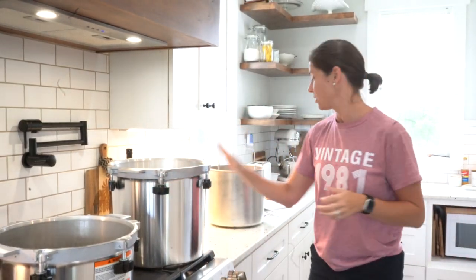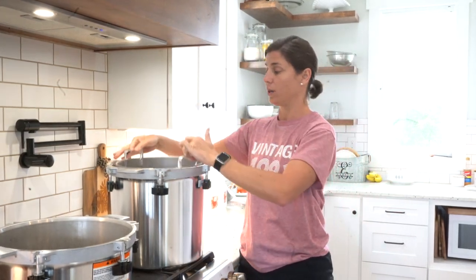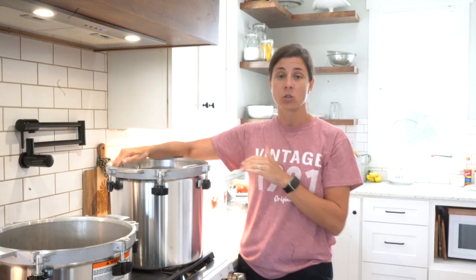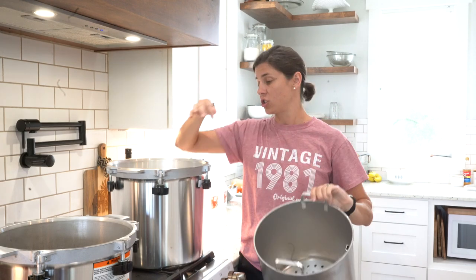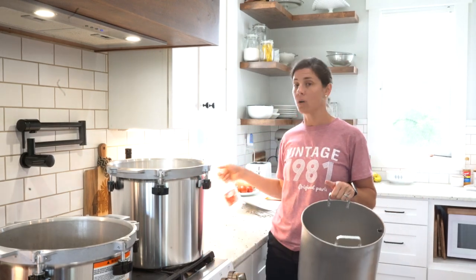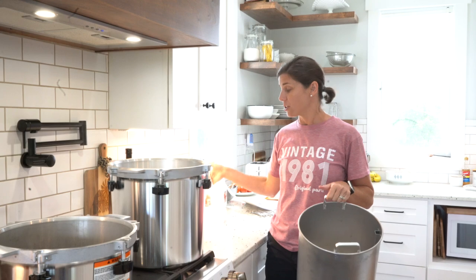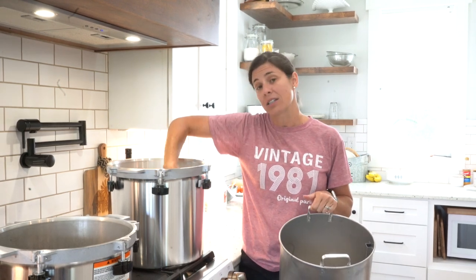With the steam sterilizer you also have an inner pot and an outer pot. You have to use distilled water in here. Per the instructions, if you do not have distilled water you can use other water — they just recommend that you clean it more often. If you have access to distilled water that's what's recommended. In a grid-down situation you could use whatever water you had, you'd just need to clean it well.